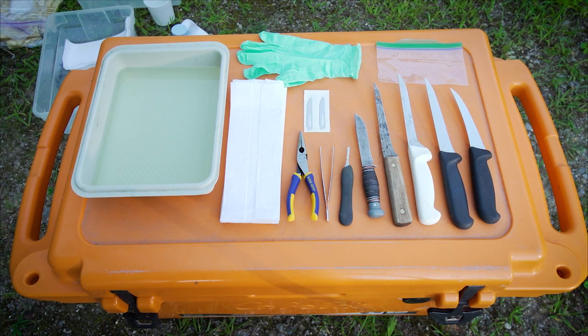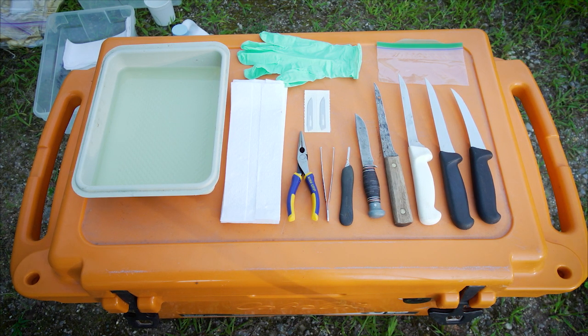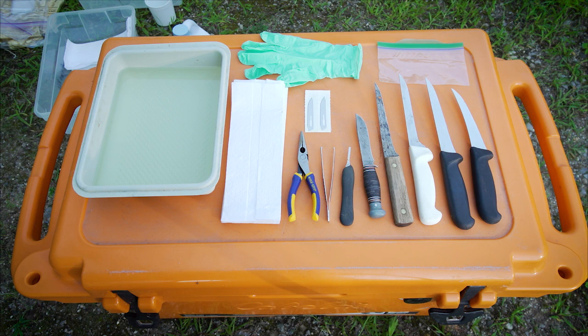You will need a pair of disposable gloves, a knife, something to grip the nodes with like a pair of forceps or pliers, a Ziploc bag, water, paper towels, and a 50-50 mixture of water and bleach for disinfecting.